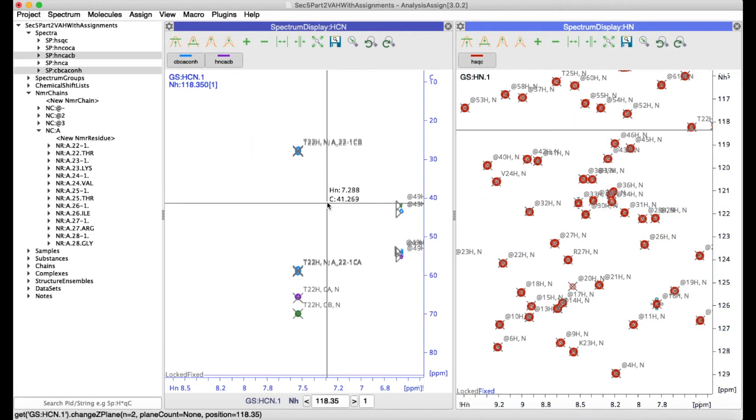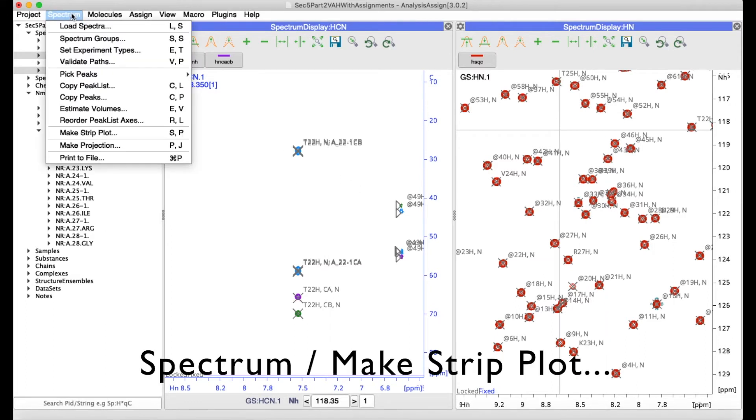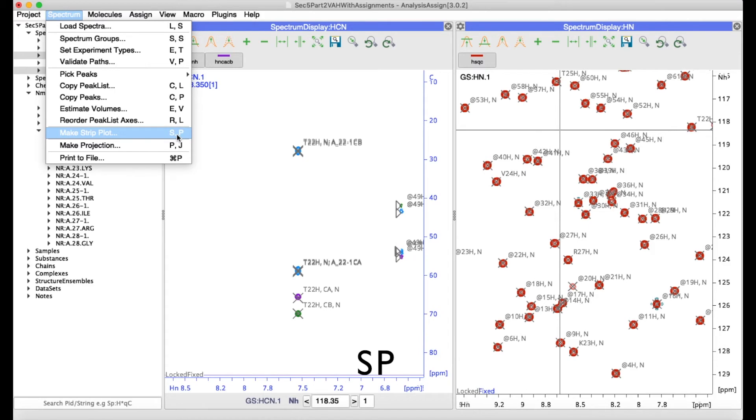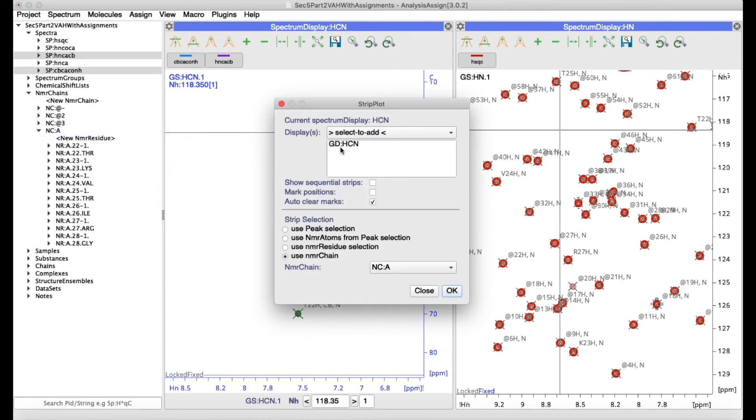Now a perhaps more useful way to create strip plots involves using the make strip plots pop-up. Go to spectrum and make strip plot or sp as strip cut. Here you can select which display you want to be using and then you can select for instance to create strips for a particular NMR chain.